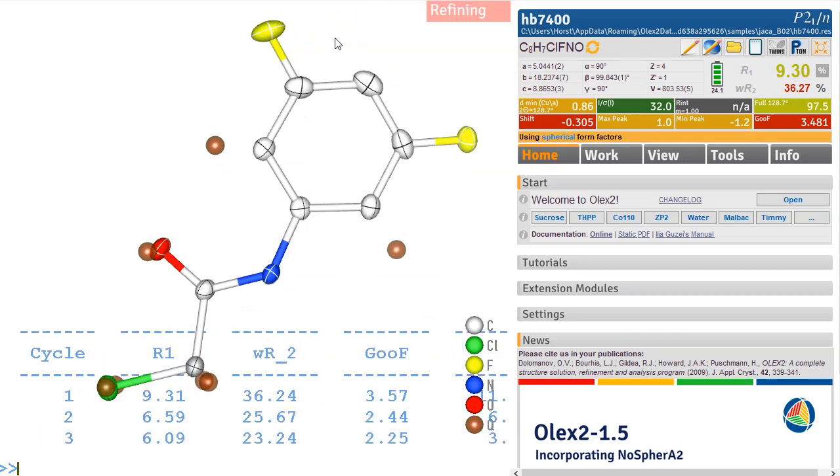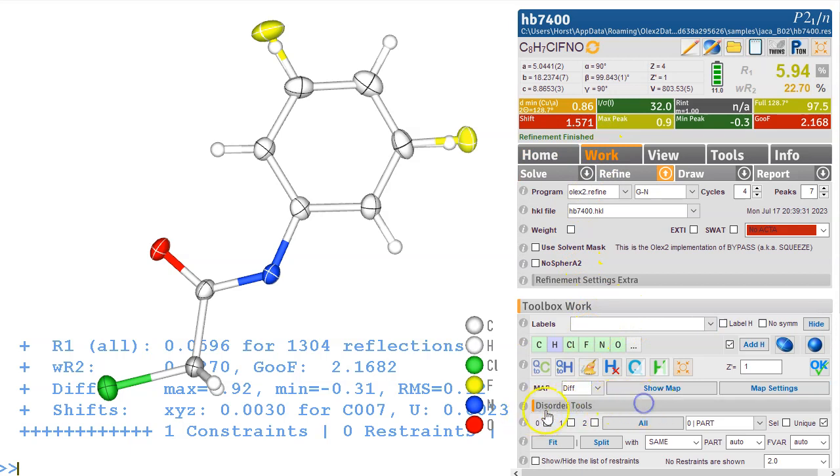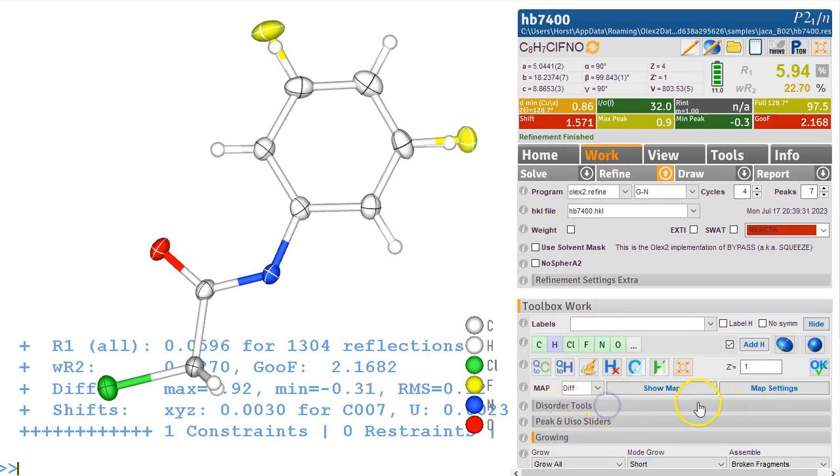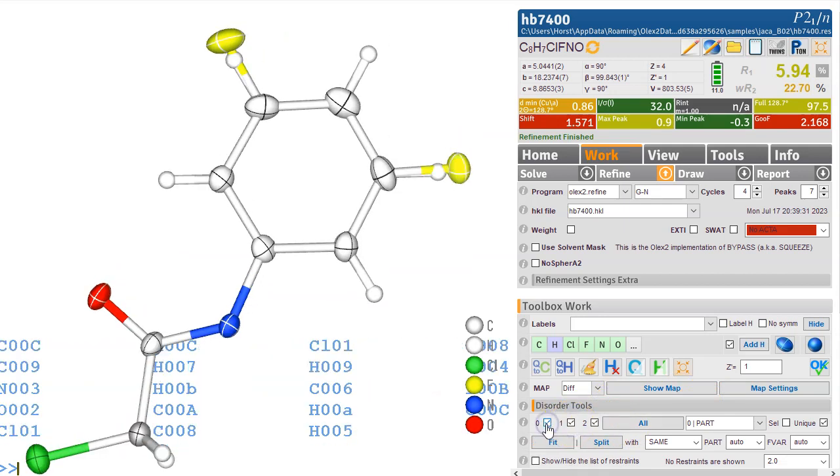Make it anis and refine that again, add the hydrogens and watch this one here, so there is a peak here so that's clearly a hydrogen that needs to be there. If you want to look at this slightly differently we can go to work and then we go to disorder tools which may be short for you so you open that up, and we can look at part 0 and part 1, part 0 and part 2, and look at all the parts here.